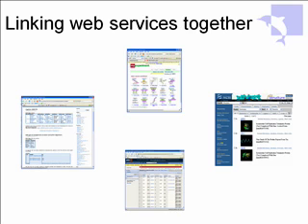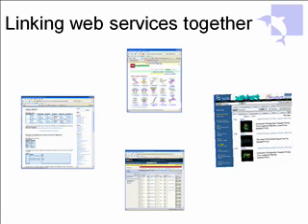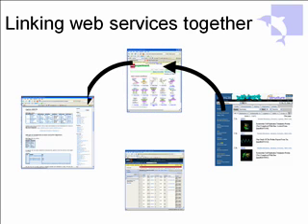maybe a data file, maybe a sequence file of a thing, so that the workflow could then go off to the database or to any other database. This could be some other data store maintained by a facility of some sort where you've gone to do some experiments. And then you might want to combine those sets of data and send them off to query another database. I've shown GenBank here, but it could be any sort of other data analysis, which pumps it back into your workflow engine. And then ultimately, of course, all of this has to be put back into the lab book, because you've got a record of how this thing was run.